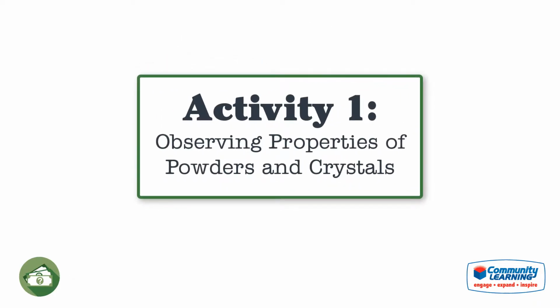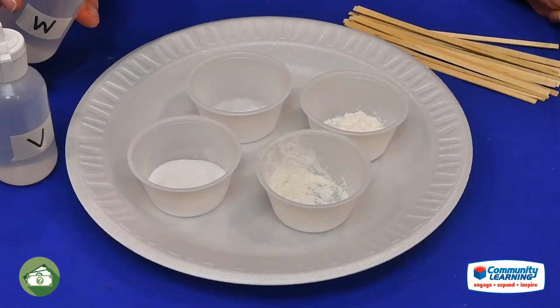Activity 1. Observing properties of powders and crystals. Students will make observations and run chemical tests on the 4 powders connected with the suspects in this case. They will record the observations on the data table in the student book.